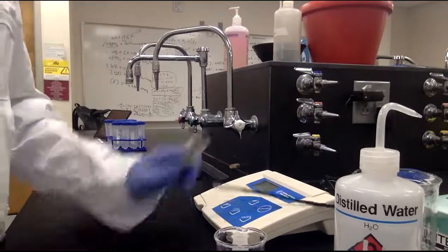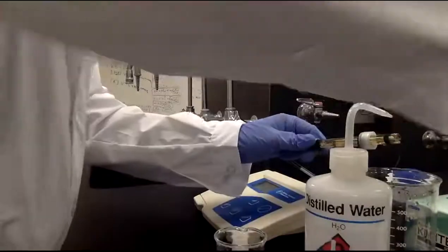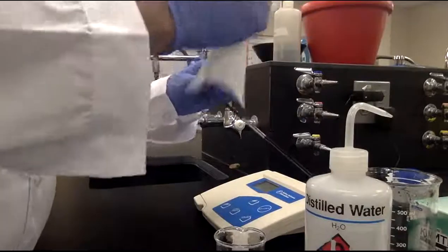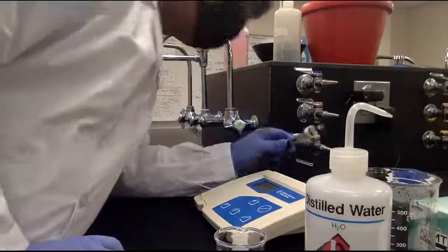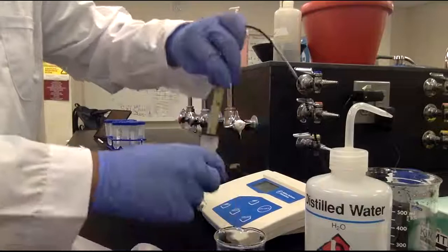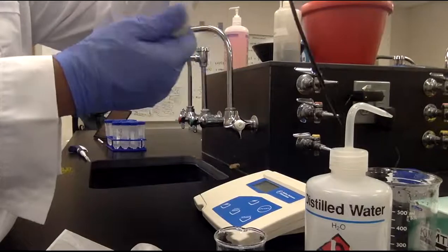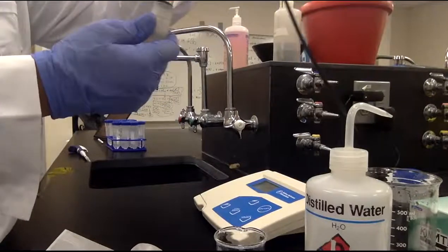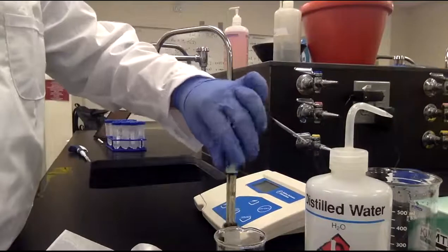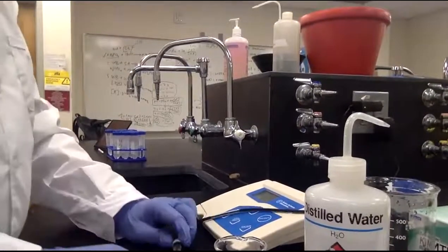Okay. Now you clean this. I believe we're done, right? Yes. Is there a... Right here. That's nice. What liquid's in it? Is it something to keep it clean? It's saturated potassium chloride solution to protect the probe. I see. Okay. Now you clean the things up and you're good to go.